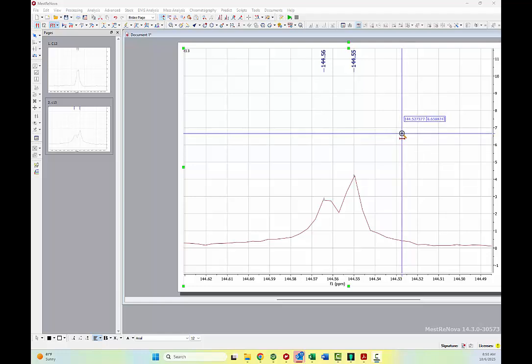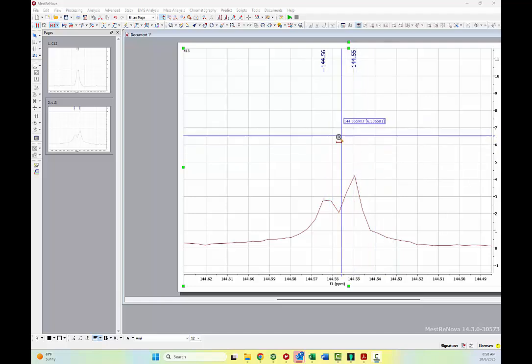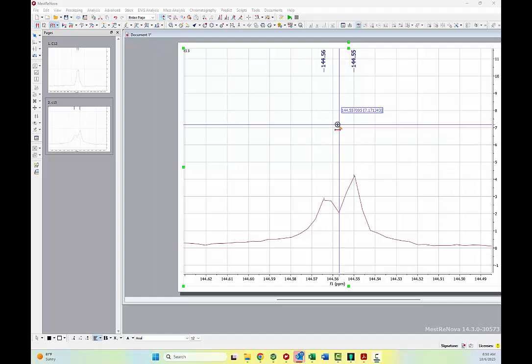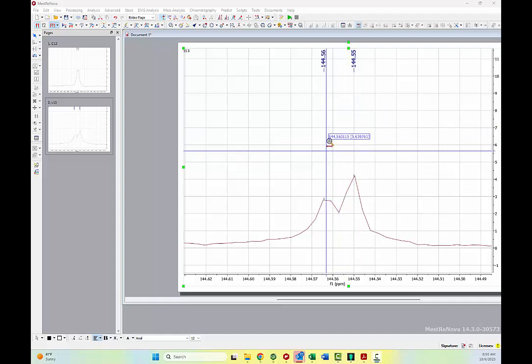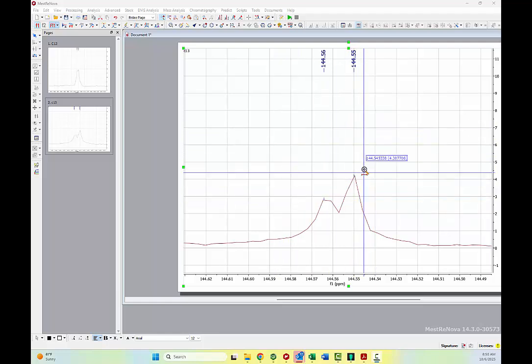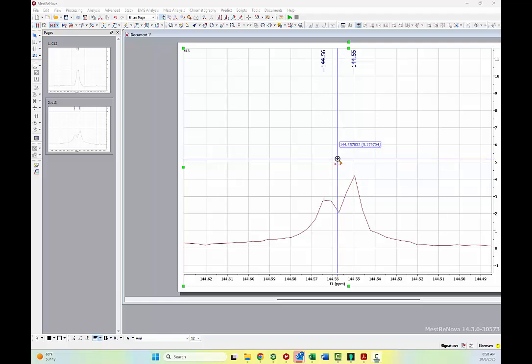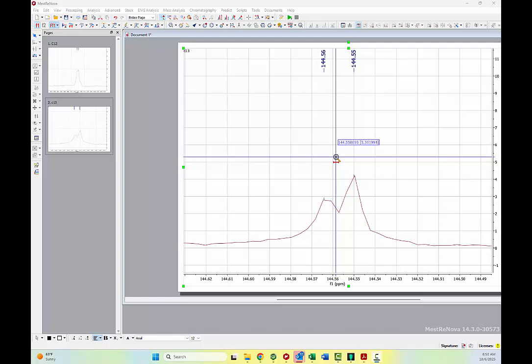Whereas if you have 6 carbons, but this one here you're counting as 1, and it turns out you really need 7, then you might start to think that maybe, in fact, this is 7 carbons, 1 there and 1 there. But again, by far the most likely thing that's happening when you look at a C13 is anything that looks like it should be 1 line truly is 1 line. And though that doesn't have to be the case, it's more often the case than not.